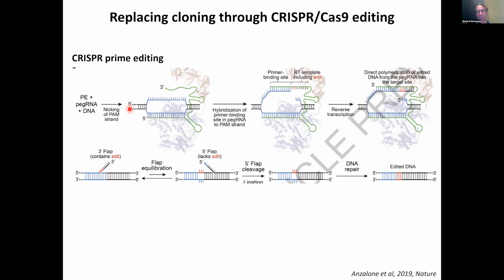And by just designing the right CRISPR guide RNA, again using molecular cloning, cloning it into a plasmid, adding that to a cell, you can make the cell do the hard work and change the genome sequence in a very precise and predictable way. And it's not perfect yet. Still, when you do this, that perfect mutation that you've programmed only occurs in maybe 10% of cells.